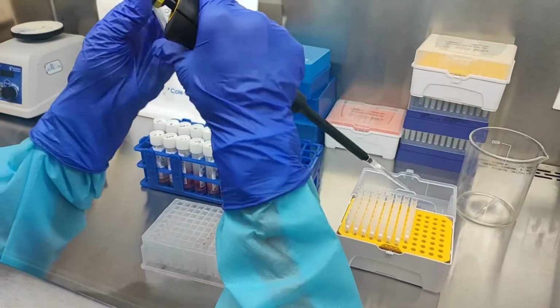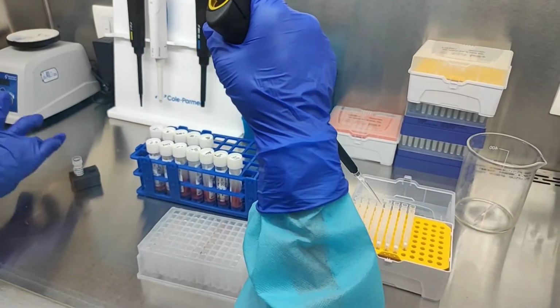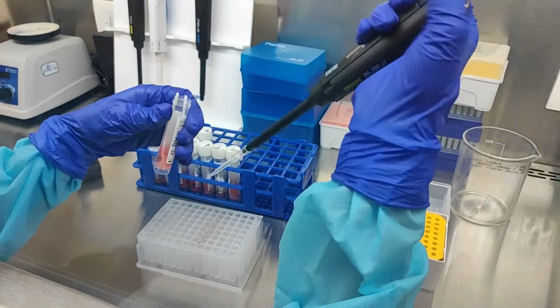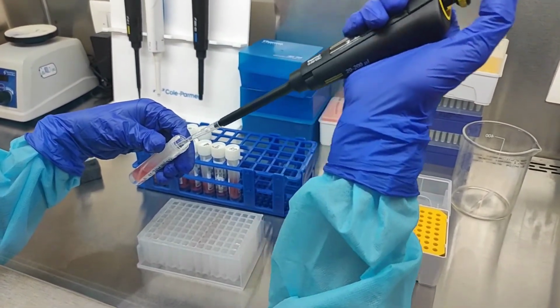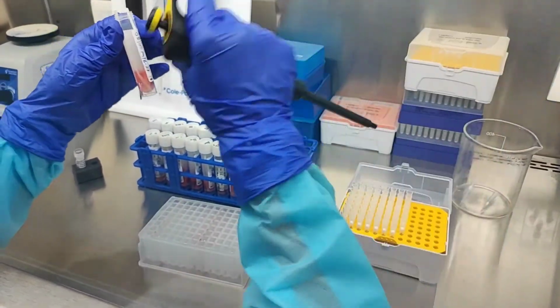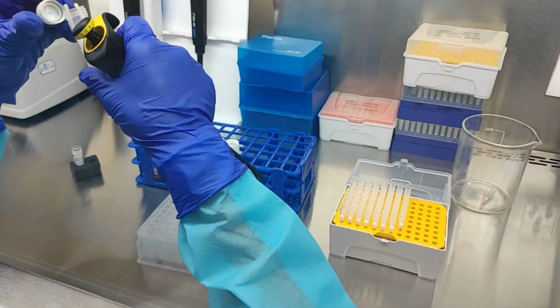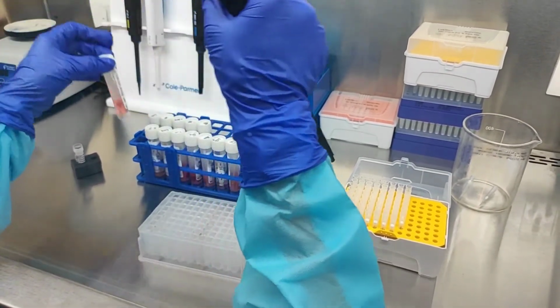And now dispensing 200 microliters of sample in the first well of the plate, and continuing dispensing the samples in the designated wells.